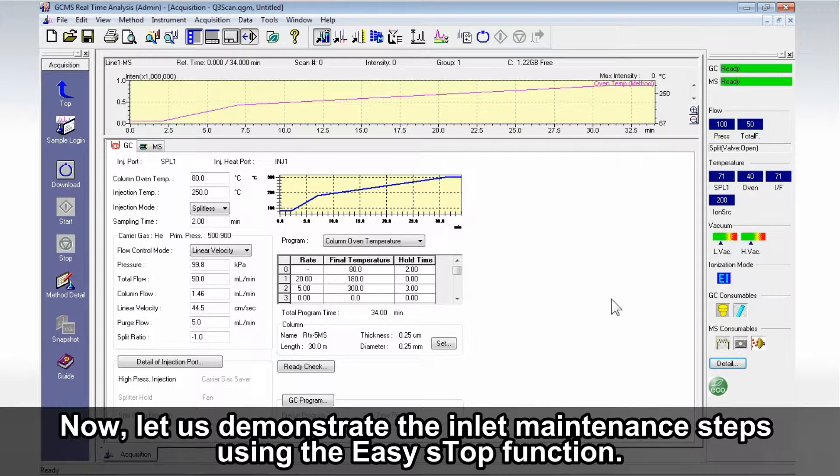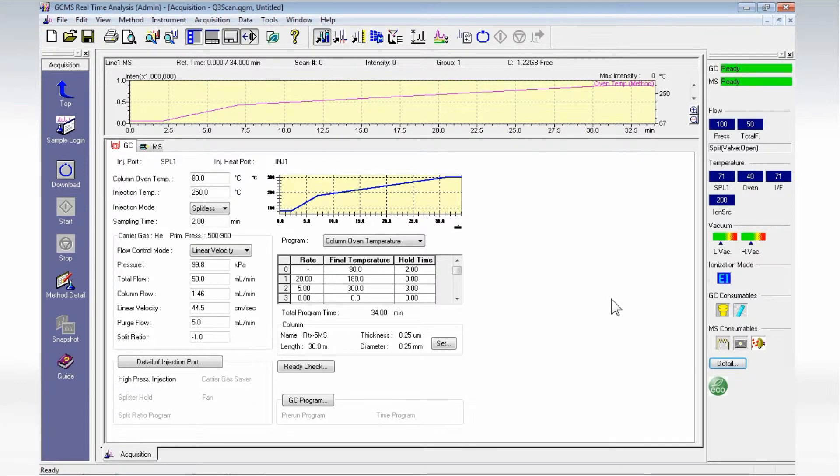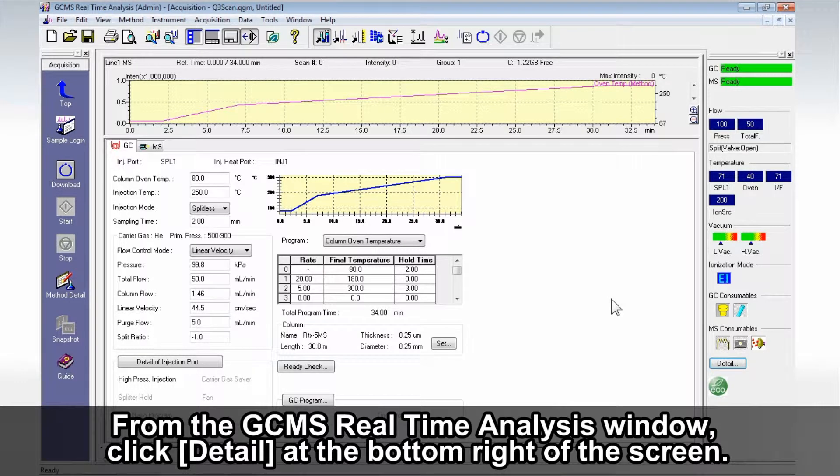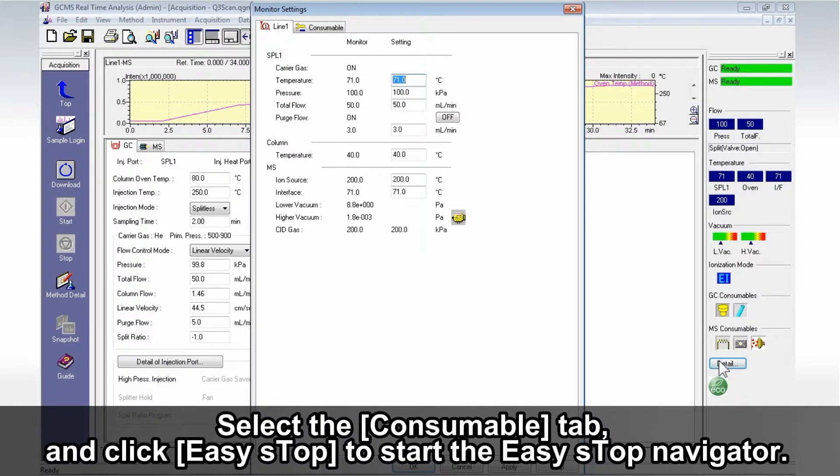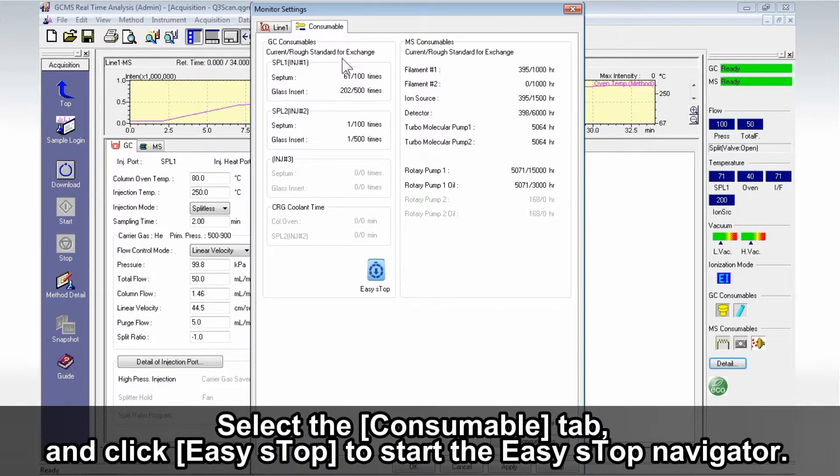Now, let us demonstrate the inlet maintenance steps using the EasyStop function. From the GC-MS real-time analysis window, click Detail at the bottom right of the screen. Select the Consumable tab and click EasyStop to start the EasyStop navigator.